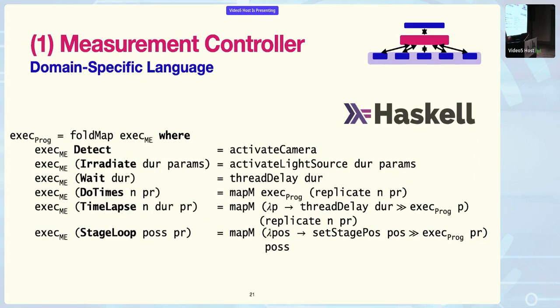Yeah, so in the graphical user interface, we constructed and they're connected, so almost one-to-one connected to the syntax in the DSL. And then via the DSL, we connect to the hardware. Okay, so you never actually write the code yourself. You basically just use the user interface to construct it.